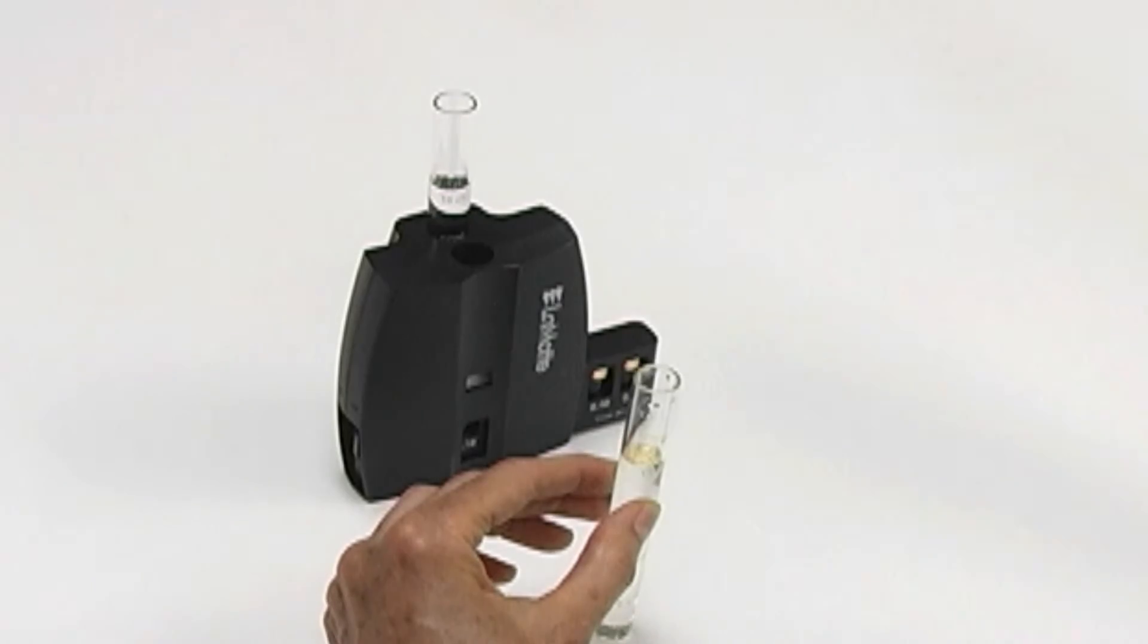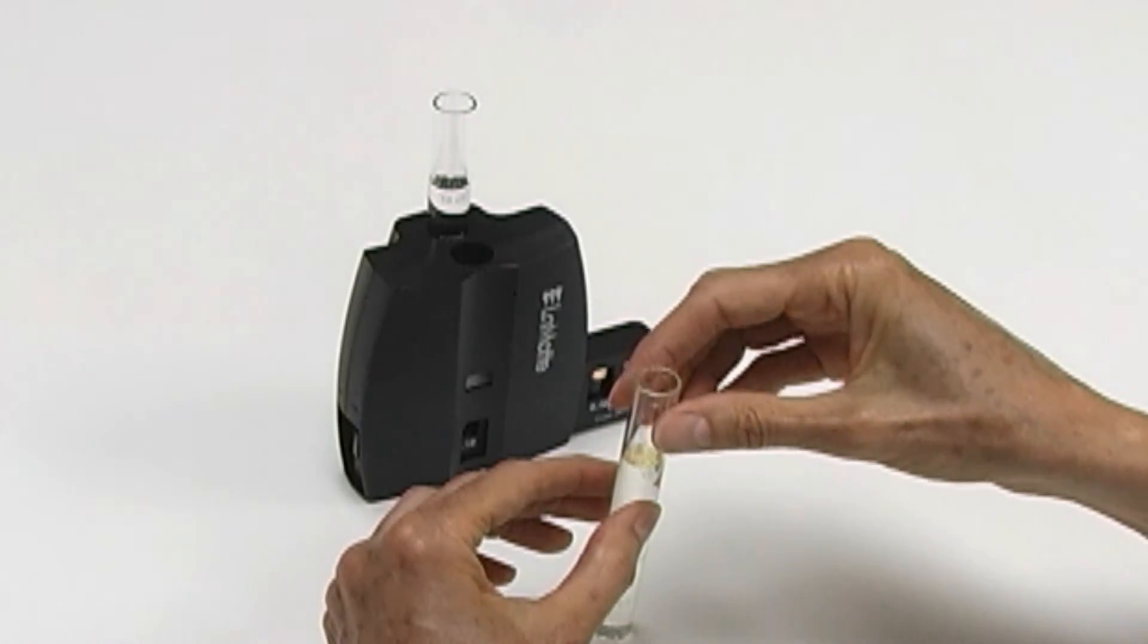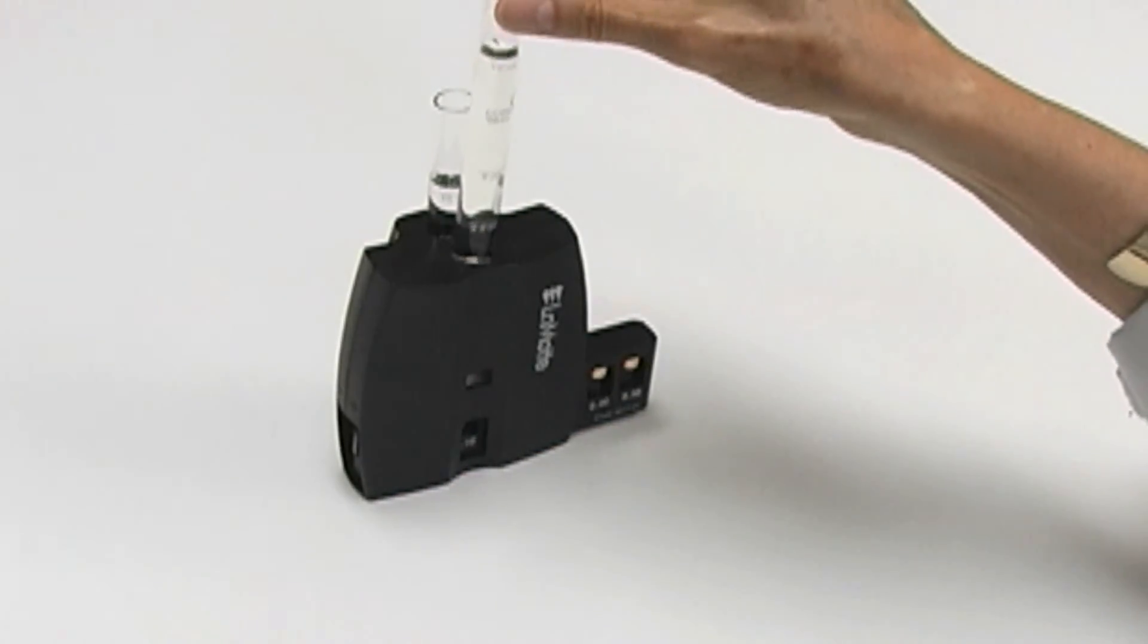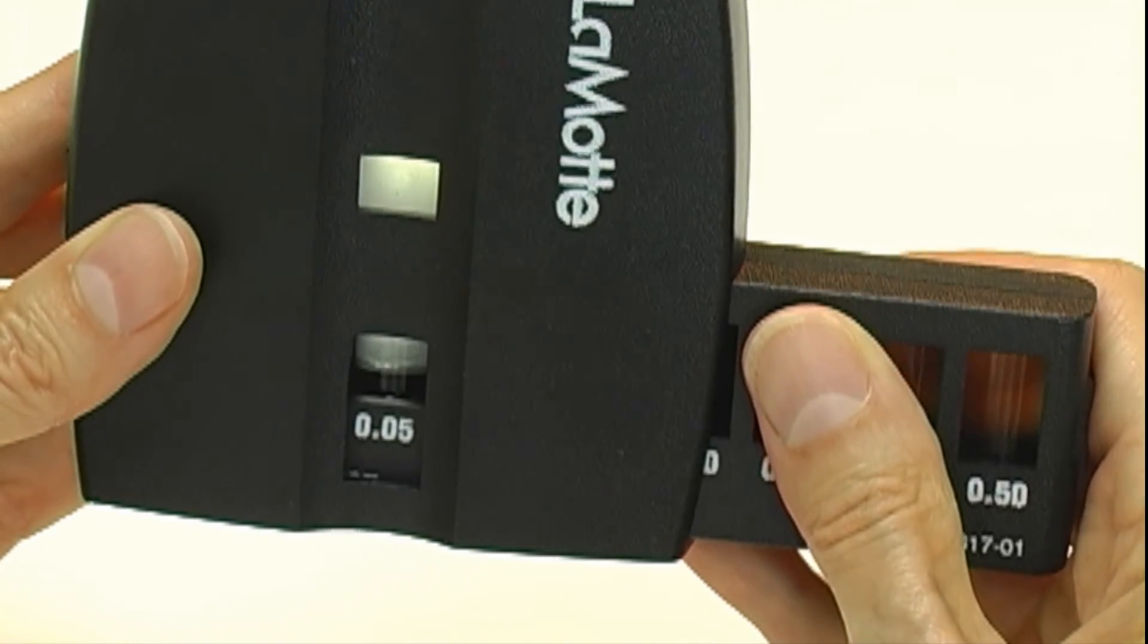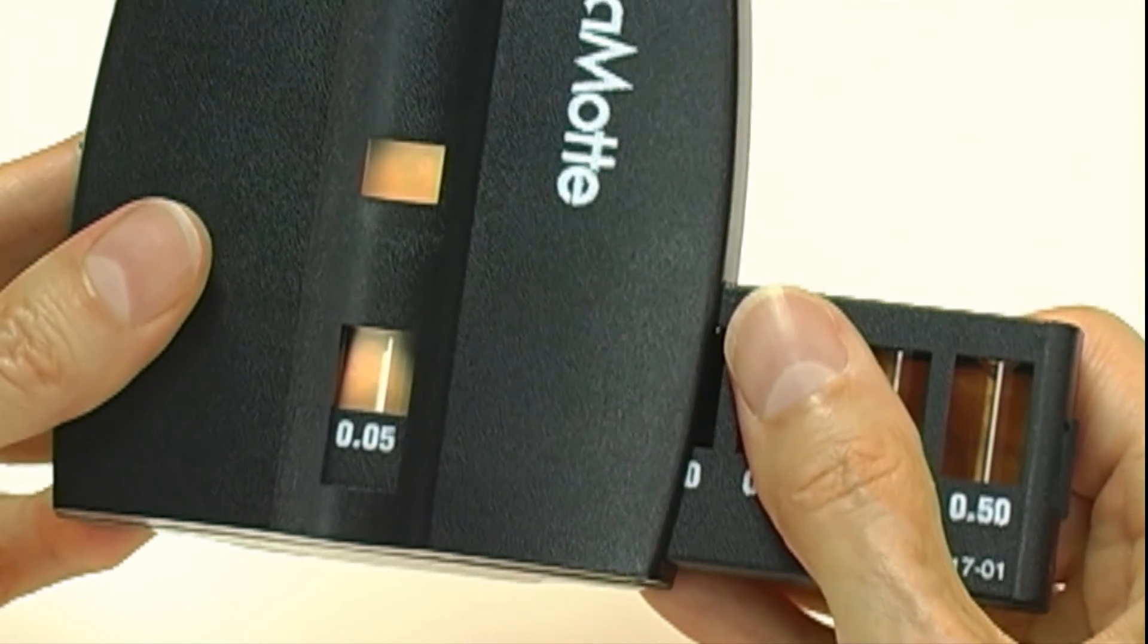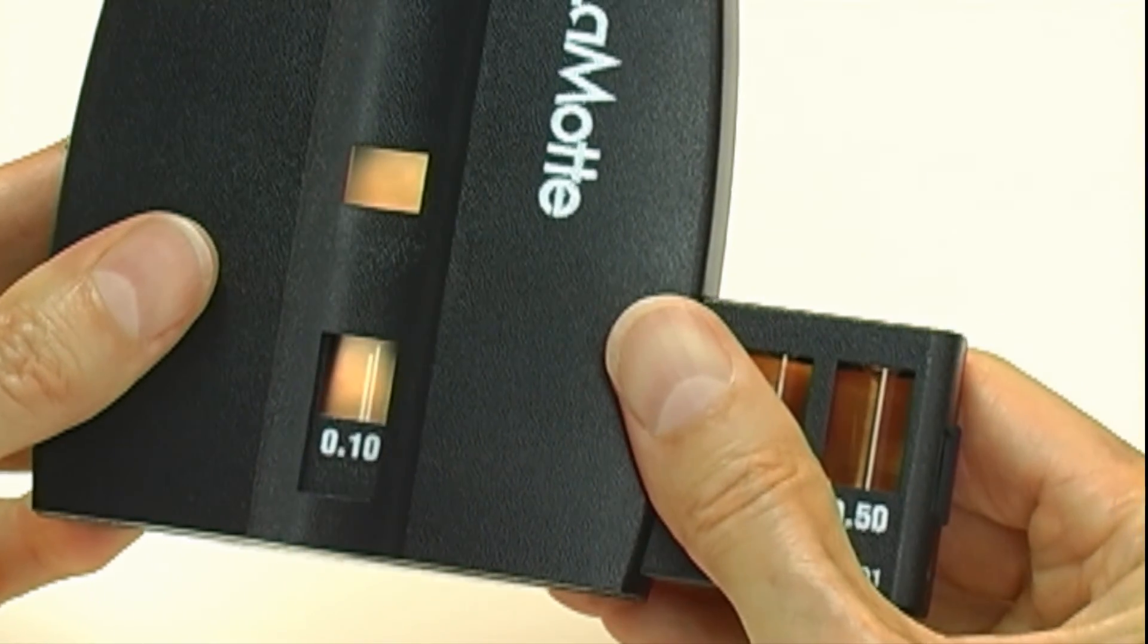Remove the cap from the tube containing the test reaction and insert the tube into the front hole of the viewer. Position the comparator so light shines down and through the uncapped test tubes. Tilt the comparator until the sample and color standards light up, then slide the bar to match the color reaction to a standard.